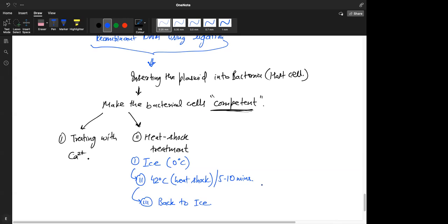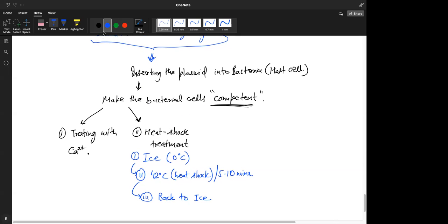Yeah, cool. So this is another way. The third way is called microinjection, but this is not a very high throughput way. You cannot send plasmid into too many cells. As you can understand by the term, it's exactly injecting the plasmid directly into the nucleus of a cell. We can do this for bigger cells like an animal cell, like a lymphocyte or a big WBC of a human, but not very small cells like bacteria. It's not that feasible.